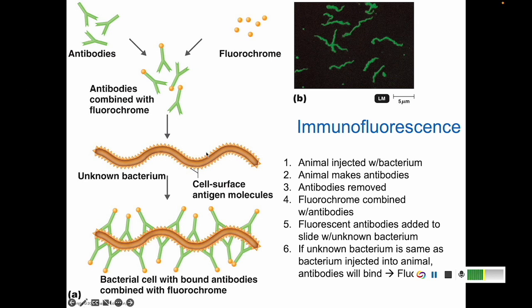So here's a bacteria and you say, I don't know, does my patient have syphilis or not? So you have these antibodies that only stick to syphilis, and they'll stick to this. If they stick to the cell and glow, you say, yep, that's a positive sign. This patient has syphilis.